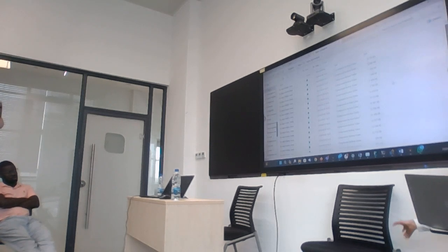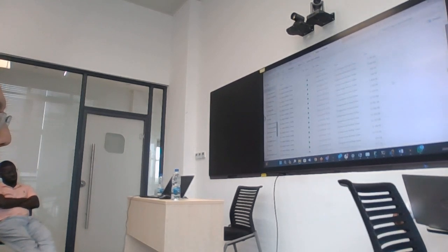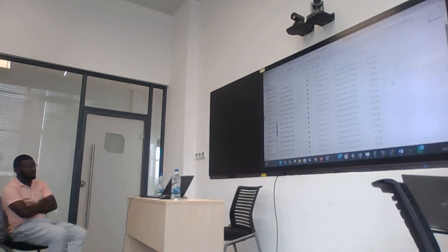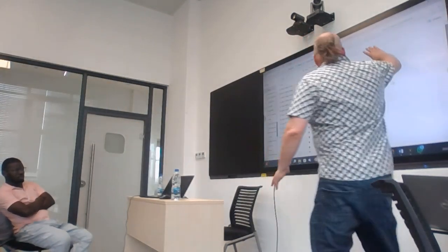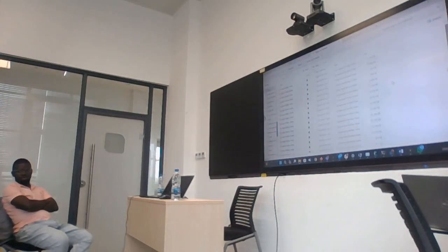Looking at the screen, which samples do you think are bad samples? Just look at what you can see on the screen. I know you might have to peer closely. What do you think is a bad sample? That's the small size. The small one, right? Now, I took these from the paper where they first described the Yale Mpox primer schema.